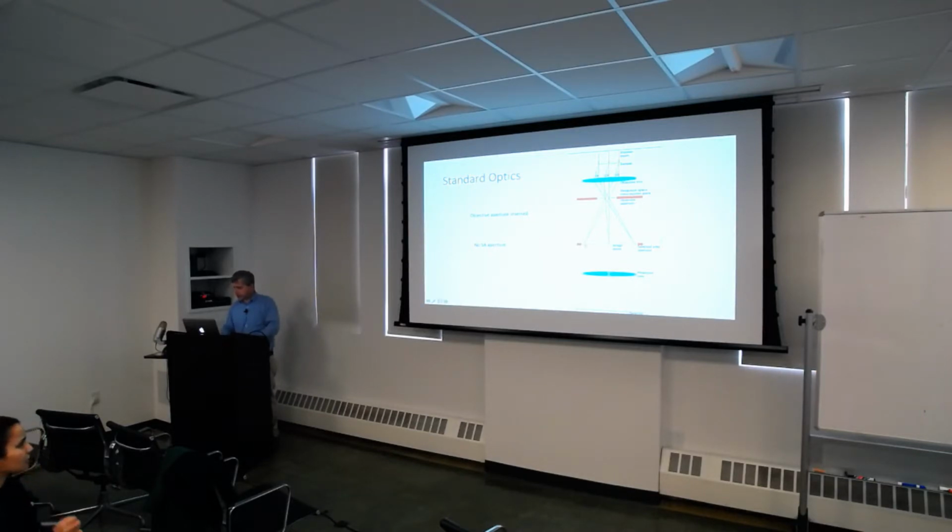And then there's also something which we generally do not use as a selected area aperture, which is in the imaging plane. And so that limits what actually you see. In terms of regular imaging, there's really not much reason to use a selected area aperture, but in terms of diffraction imaging, there is.